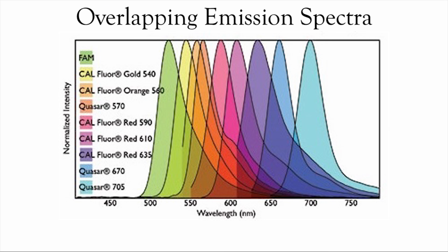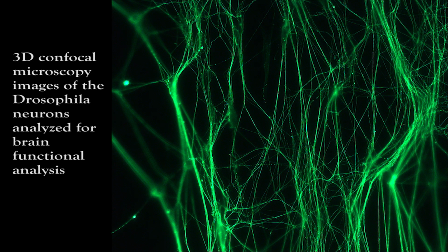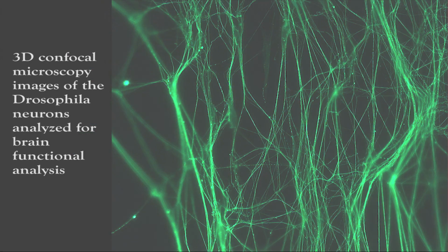In most applications, fluorochromes have overlapping emission spectra. Hence, the emission signals cannot be separated completely into different detection channels, resulting in crosstalk. However, if fluorochromes have distinct excitation spectra, the fluorochromes can be excited sequentially using one excitation wavelength at a time, and this is only possible with confocal systems that offer the multi-tracking feature. Confocal microscopy also allows for the optical sectioning of an object without physical contact, and more importantly, the three-dimensional reconstruction of specimens is achievable only through the use of confocal microscopy. The resolution is highly improved when using confocal microscopy.